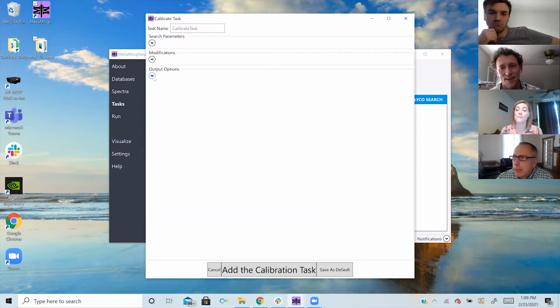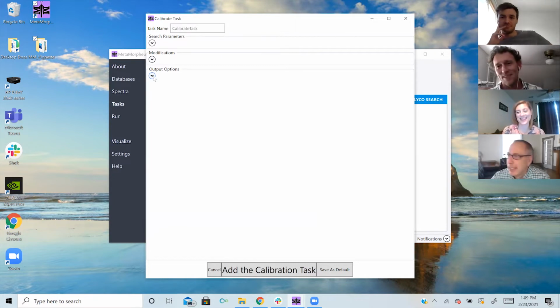Now, I know we're not going to go into that statement, but that's such a fun statement, right? Like, you're going to identify hydroxylated proline without having to blow up your search space here. Yep. I know we're not going to go into that right now, but maybe there'll be a part 2 video and we can. But it's an understatement. You have a lot of understatements going on here, but that's a big one.